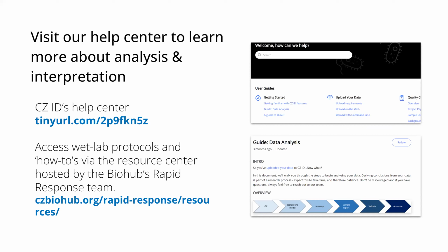So we do have a help center to help learn about interpretation, analysis, and just understanding the metrics that CZID surfaces. So there is a tiny URL link to our help center, but there's also links within the app and under the resources tab on czid.org. And then there's also access to wet lab protocols via our partners at the BioHub. The Rapid Response team has put together a number of protocols and guides to help get you started in the wet lab.